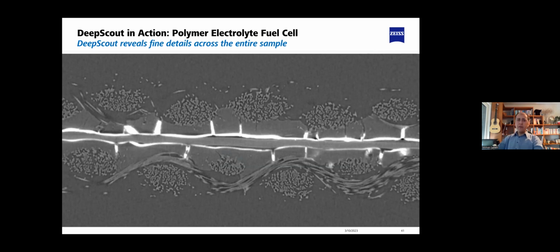So 2 examples on Deep Scout before we come to the end. As I said, in Deep Scout, we are implementing the AI reconstruction technique and technology to expand the high resolution information over a larger field of view.